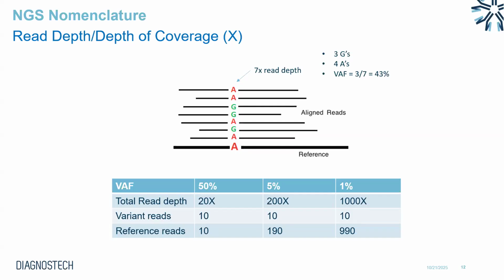However, for somatic mutations, such as those in cancerous tissue, you do require a higher read depth, as the cancer-causing mutation can be in as little as 1% of the reads. So some NGS assays for cancer, such as liquid biopsies, require read depths of over 10,000x. Really, it's just how many times it sequences the region of interest.